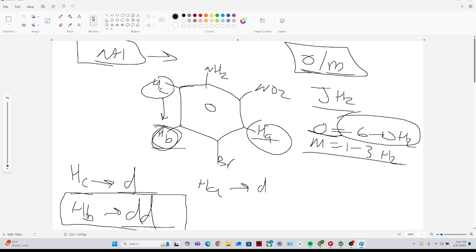It makes you more conclusive that the spectra you're looking at, and the peaks that you're assigning, are really from the actual protons that you're looking at. So go ahead and do that as well. And that's basically it on how to assign this actual structure.